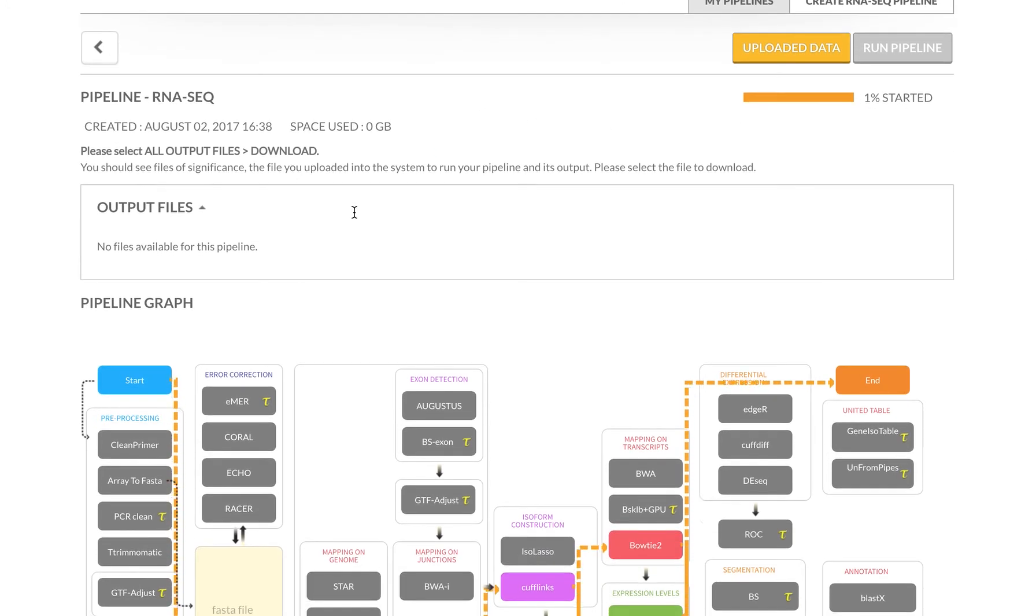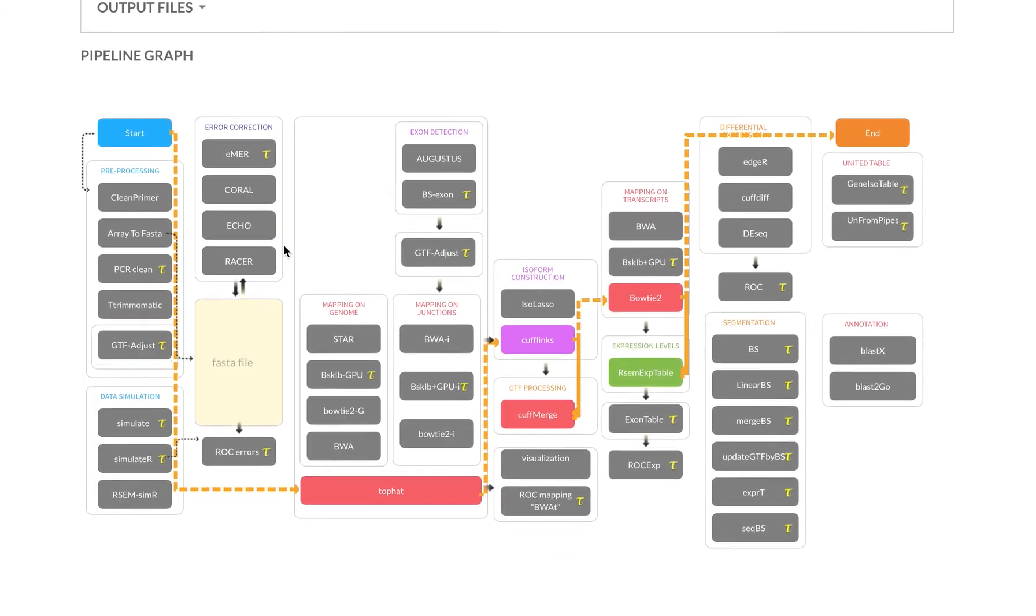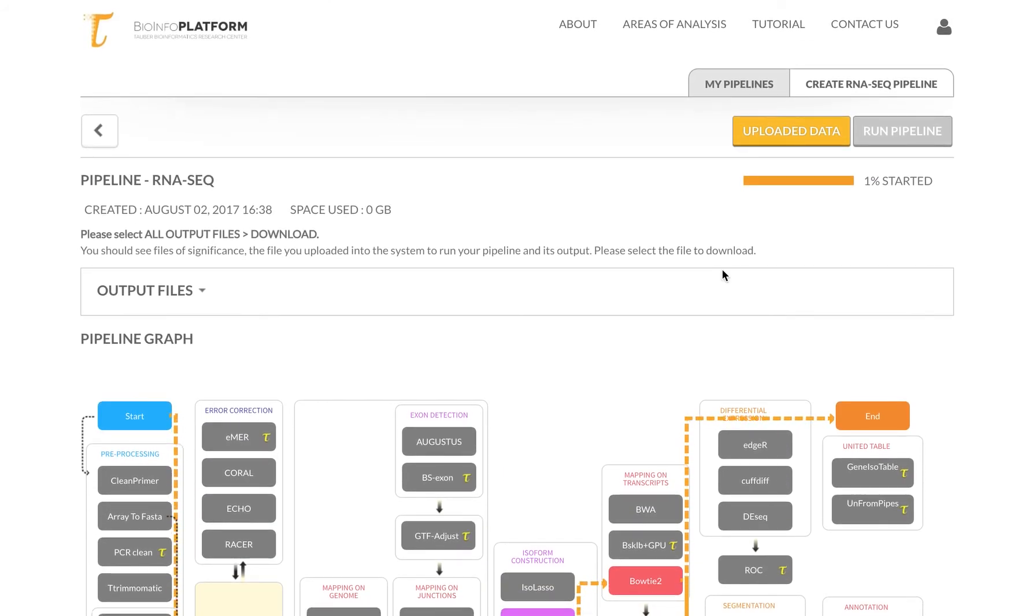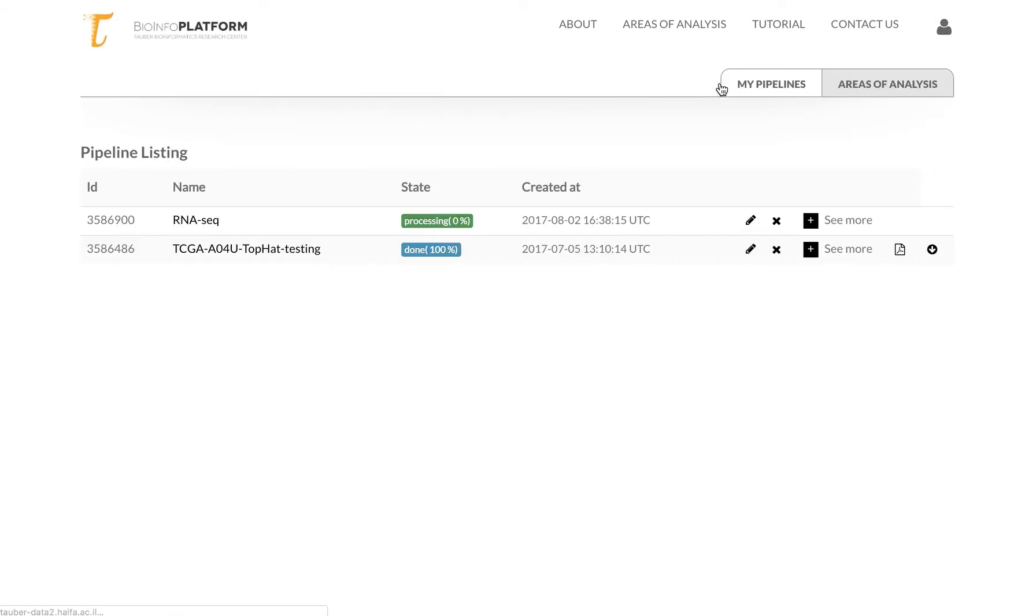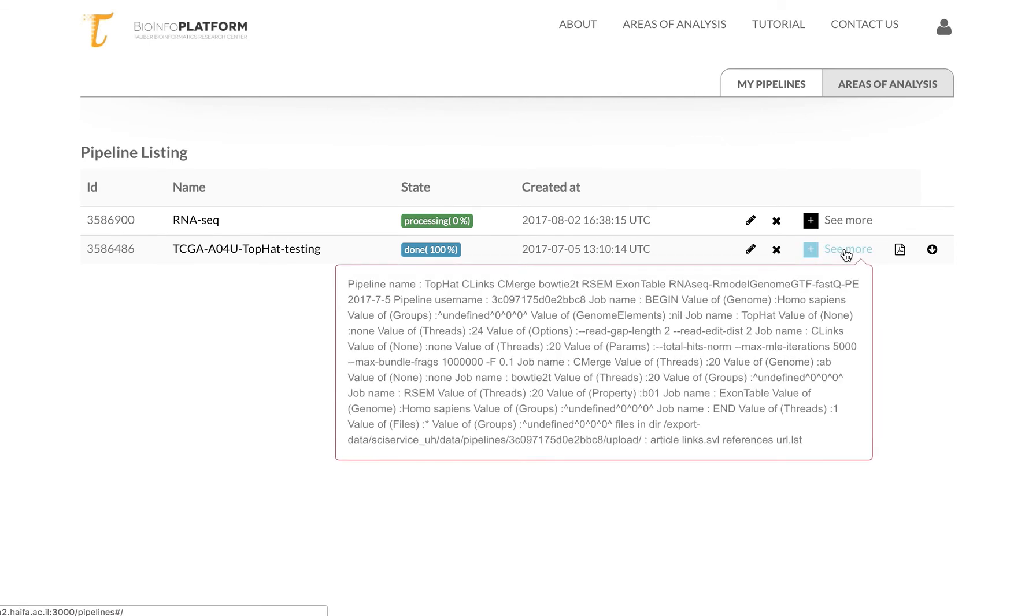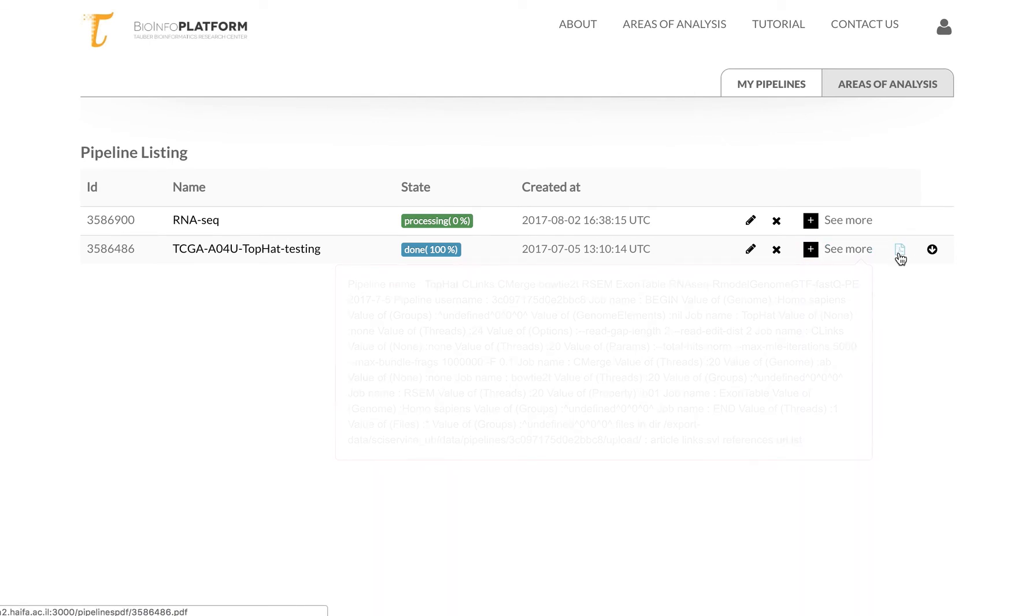And you can see the graph again. So if I go to my pipelines, you will actually see that the RNA-seq is processing it now. And once it will be complete, I will be able to see more details, download a report, and navigate to the download section.